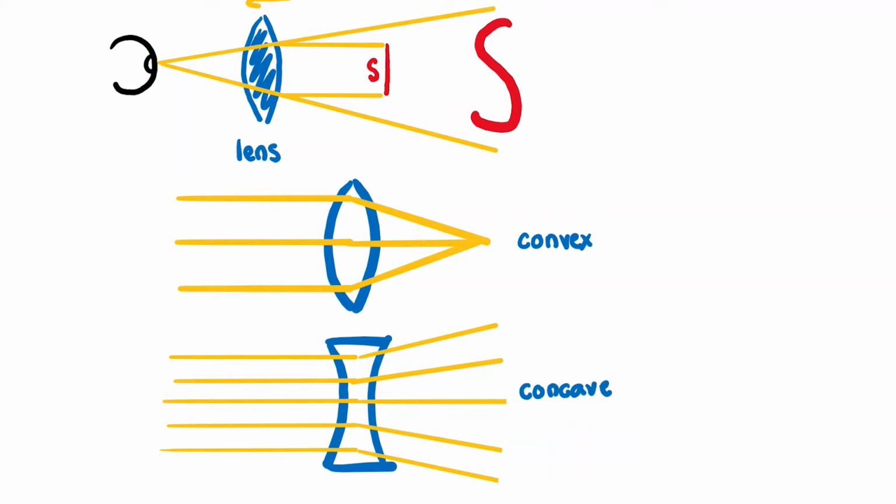And so when light passes through our convex lens, we can see that the image that is shown is actually the larger S to our eyes because our lens magnifies that image. So typically we use a convex lens in our objectives, and that allows us to magnify the tiny image, if it's a bacteria or a protist that's underneath the microscope.